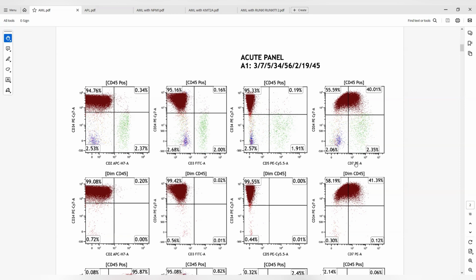If this patient gets treated, for example, and then sometime in the future, they get a bone marrow core biopsy, and then they send flow cytometry for that sample as well. If you have a myeloid blast population of about 3%, which is not really elevated, then in that setting it becomes really hard to differentiate whether these blasts are just regenerating blasts of the transplanted bone marrow, for example, or if this is a recurrence of the acute myeloid leukemia that the patient had.